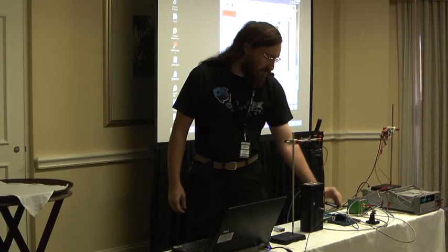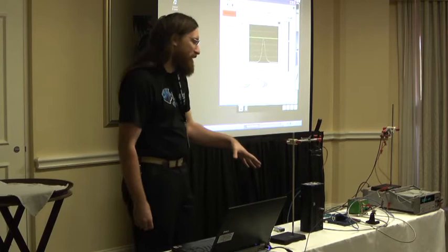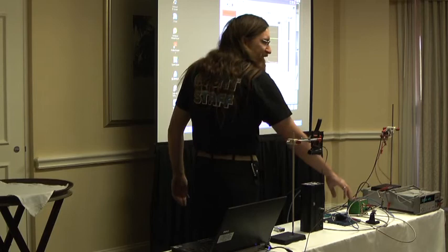I don't know how many of you have seen this setup at the trade shows we've done this year, in particular at Thomas West and Kitton. What this is demonstrating is the Jazz Indie, which is this module on the Jazz Stack — it's just one Jazz module — connected to a Sandhouse LED.